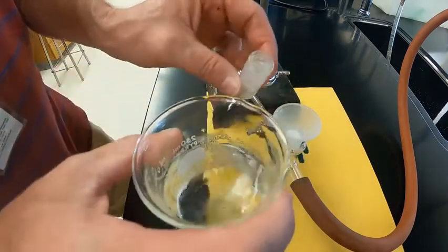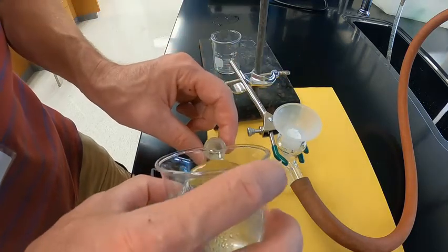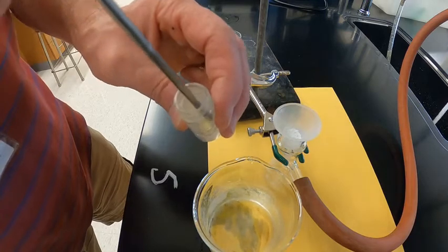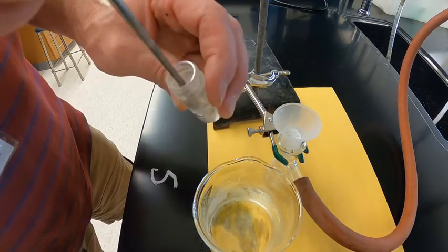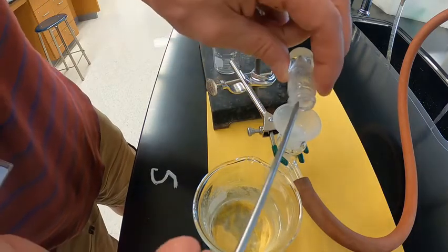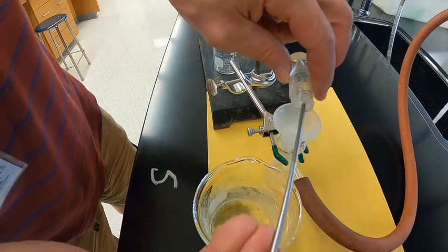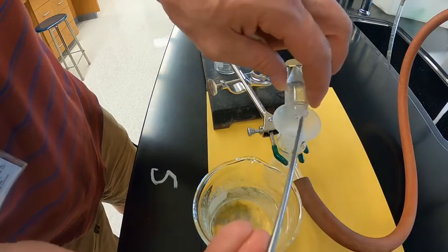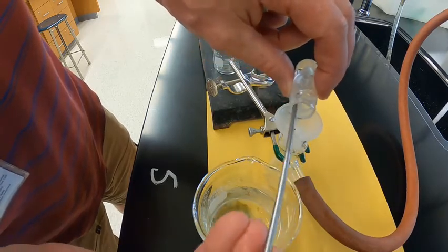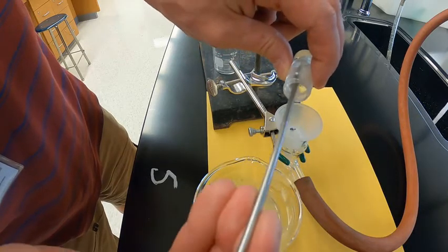You can't have too much water because the product is not soluble in water, but the reactants are. So the more I dissolve the reactants in water and wash them away, the better the purity is going to be of our end result. So I'm just going to scratch out the little boiling chips. Try to get as much product out as possible.